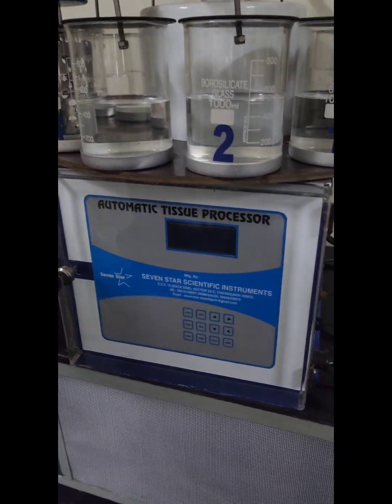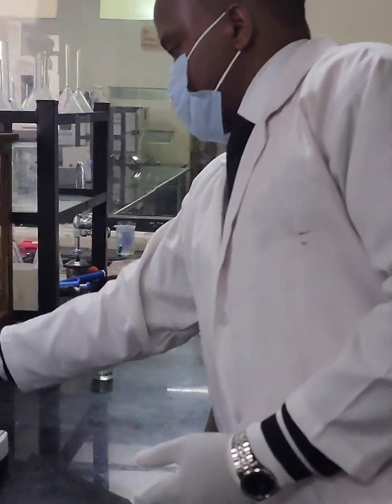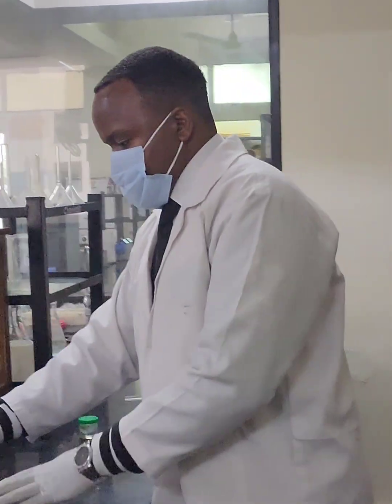From here we'll be going to a crucial step, which is microtomy. In microtomy we'll be using this important equipment referred to as the microtome.